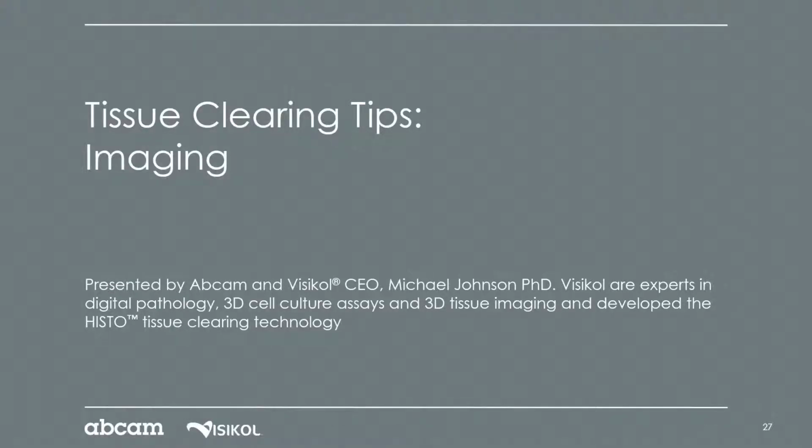So one of the things that we see a lot is that researchers will try and label a tissue, they'll try and clear a tissue, but they won't necessarily know how to actually image the tissue and acquire the data that they're going after. Each imaging system has very specific use cases where it's great to use that imaging modality and other use cases where it's non-ideal, and understanding those is very important in adopting tissue clearing, because you can go through your whole process, and if you go to your imaging core and they don't have the imaging modality that's compatible with the type of tissue prep that you did, the tissue prep that you did was not worthwhile.